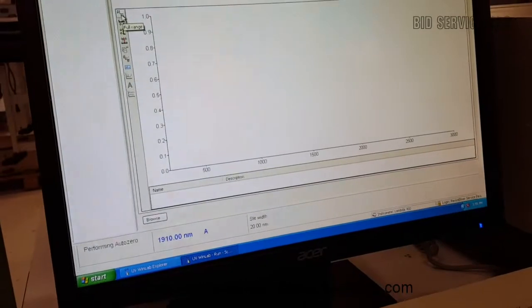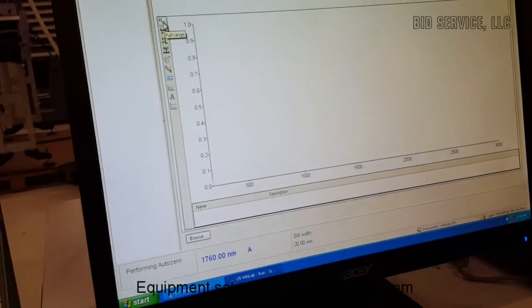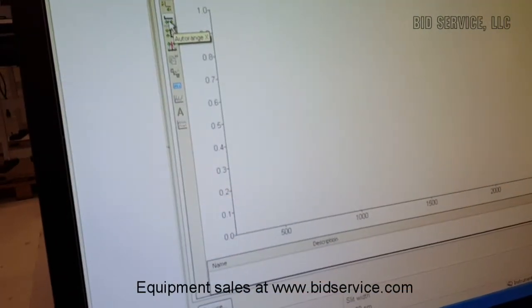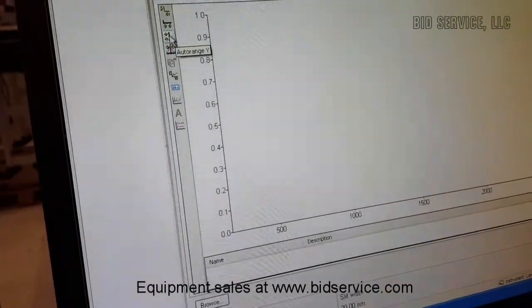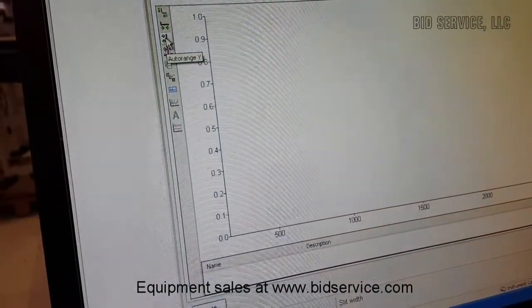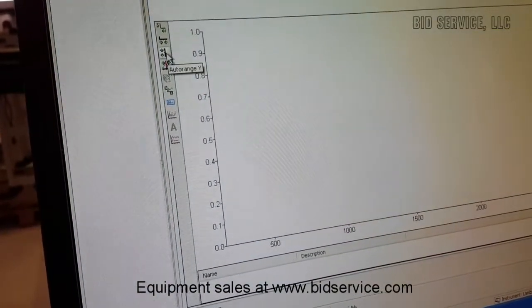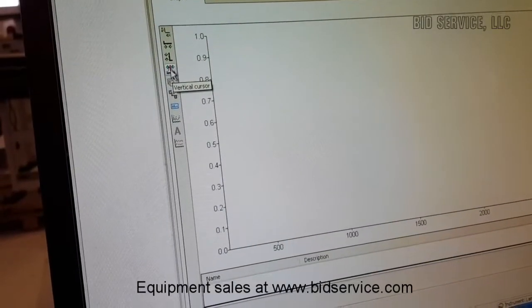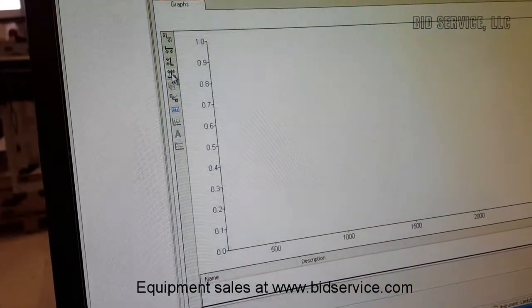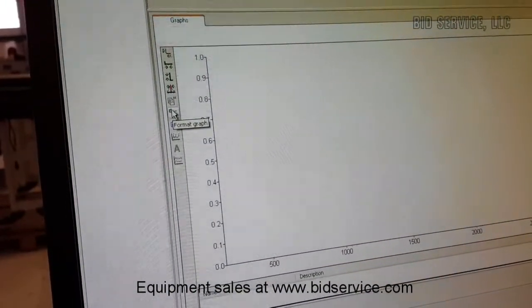So there are various tiny buttons here for changing the full range of the scan and auto ranging the x-axis, which is the wavelength, and the auto range of the y-axis, so that depending on the signal amplitude, the signal level, the y-axis will be adjusted. And then there is also a feature of vertical cursor mode. And the graph can be formatted at any point of time.